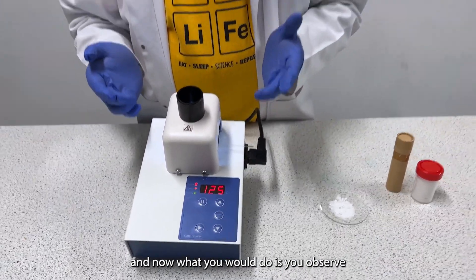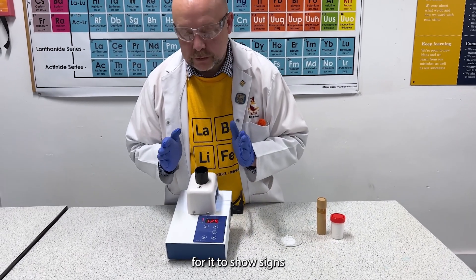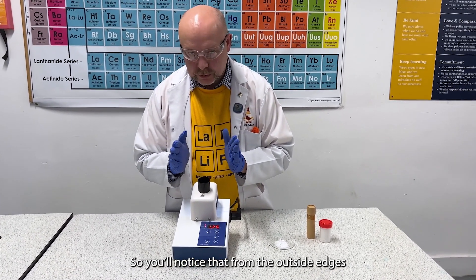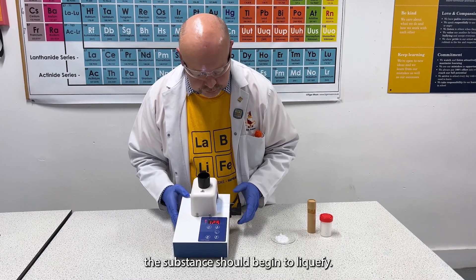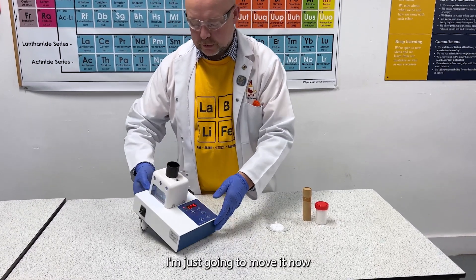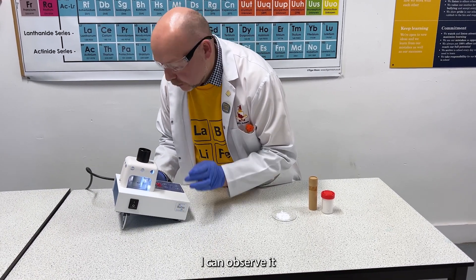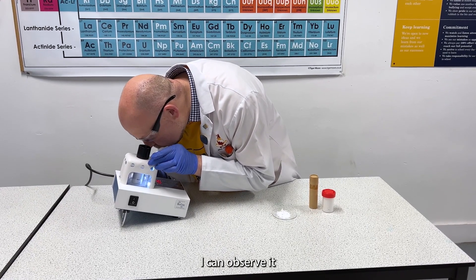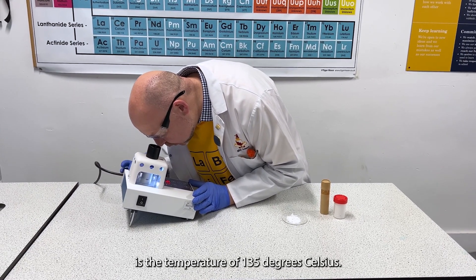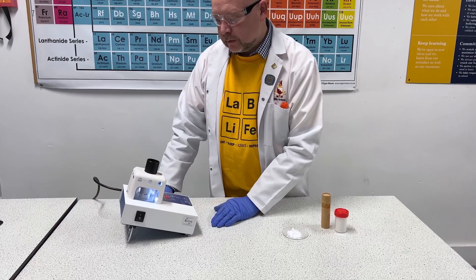Now what you would do is observe the capillary tube for it to show signs that it's beginning to melt or sublime — you'll notice that from the outside edges the substance should begin to liquify. I'm just going to move a bit now so that I can observe it, and remember that what we're looking for is a temperature of 135 degrees Celsius — that's if it's really pure.